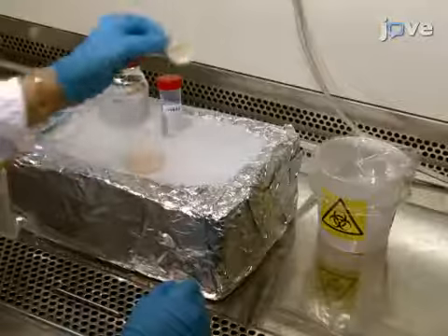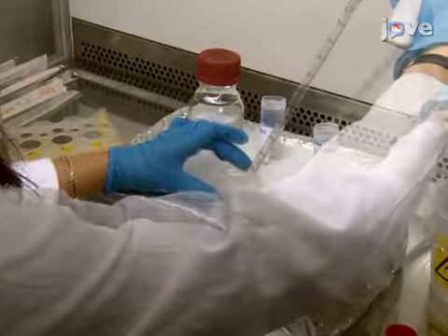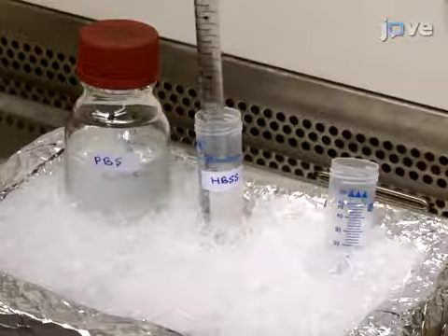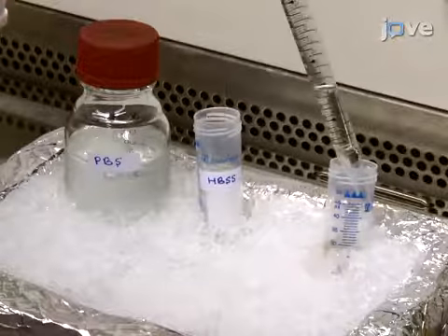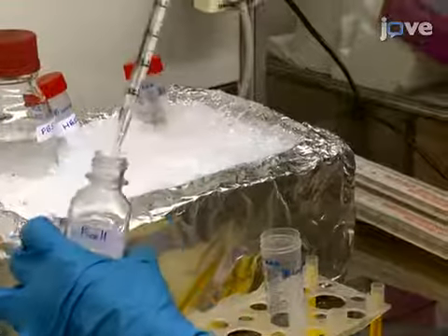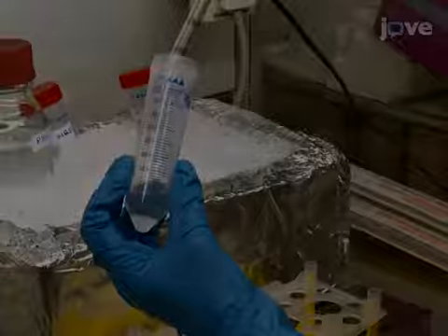When all of the tissue has been macerated, discard the strainer and transfer the resulting cell suspension into a 50 milliliter plastic centrifuge tube on ice. Bring the cell solution to a final volume of 35 milliliters with fresh HBSS containing supplements, and then add 10 milliliters of room temperature density gradient solution into a few 50 milliliter conical tubes.